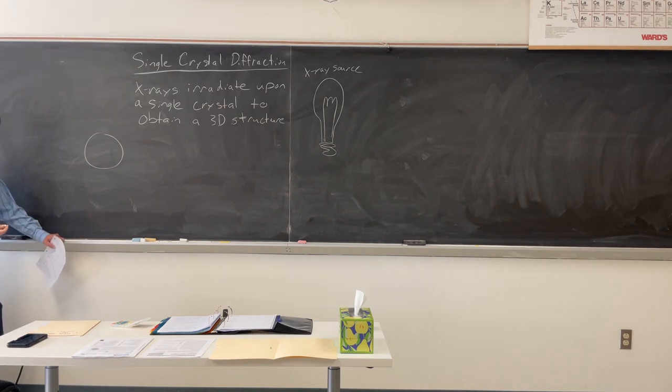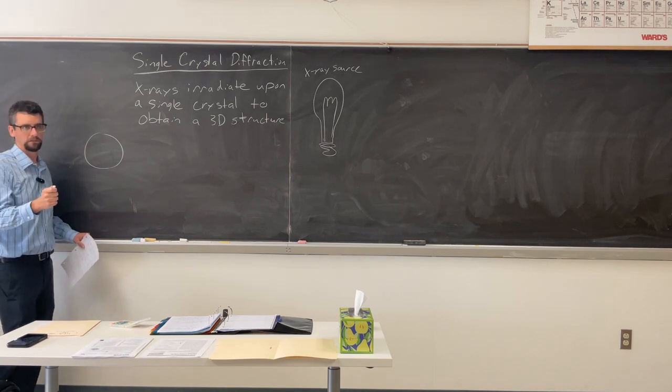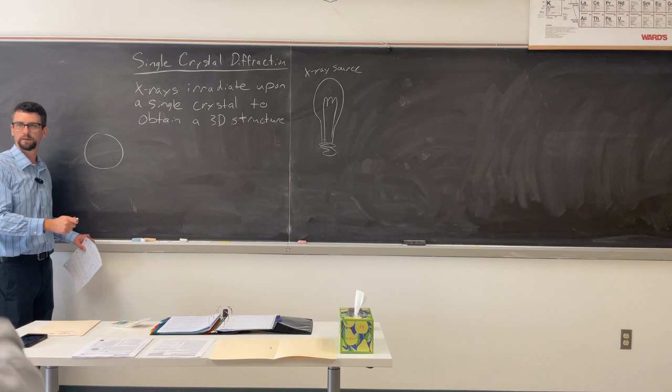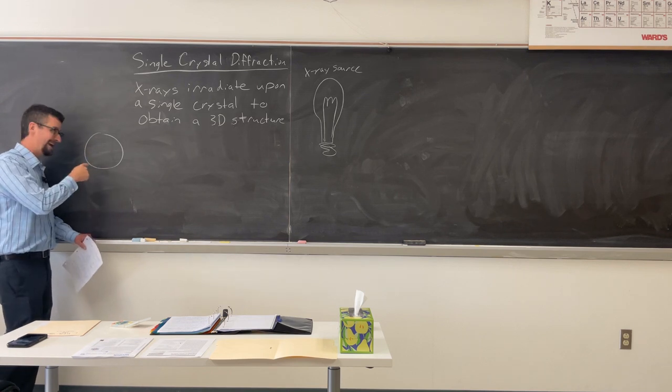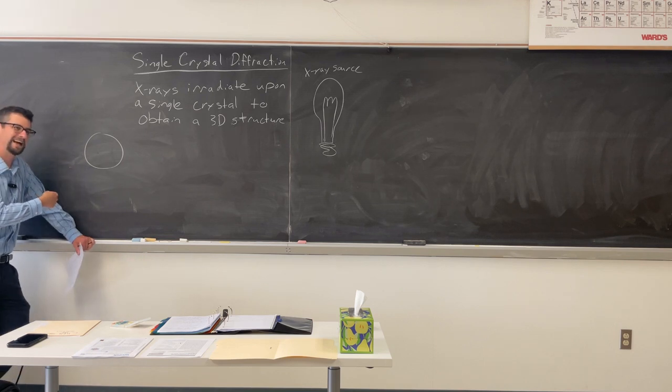If you had to pick the more economic option, a discharge tube over this thing, does anybody know how big these things are? Miles, yeah. Which one would you pick? Discharge tube. Let's say you want to know the answer very, very well. Which one would you pick? That one. It looks very simple because I just drew a circle. It's not very good for it.